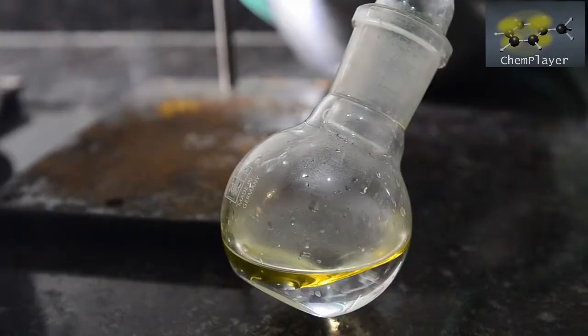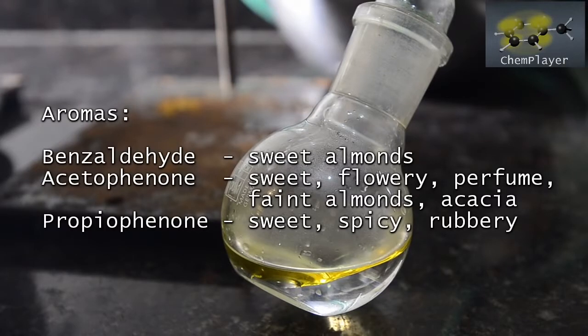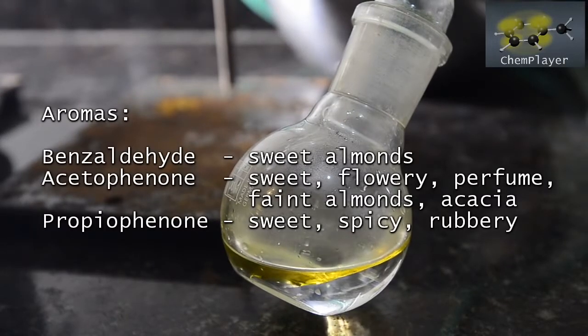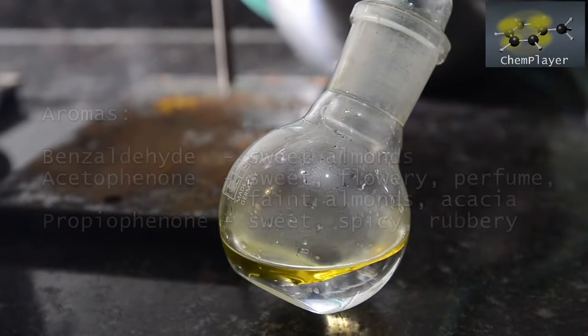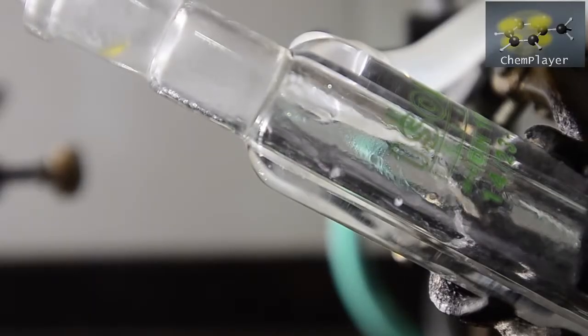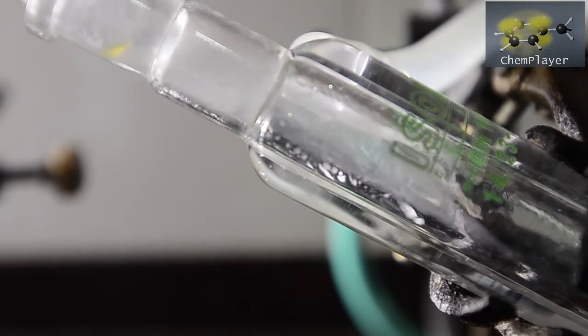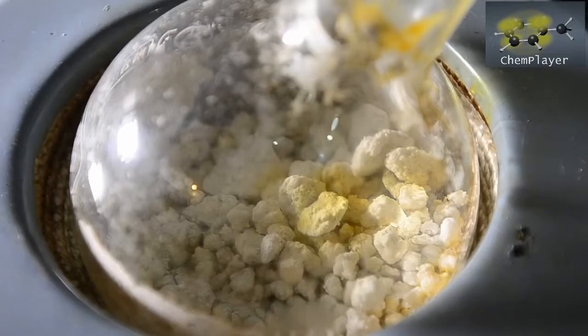And you can tell it's being produced because it has a quite intense sweet, sickly, flowery, perfumey aroma. And a different aroma to propiophenone, which is less sweet and slightly more rubbery and quite spicy. The distillation is quite slow and steady, and it takes a couple of hours before it dies down. The color of the solids in the boiling flask changes to yellow and then to a dark color.